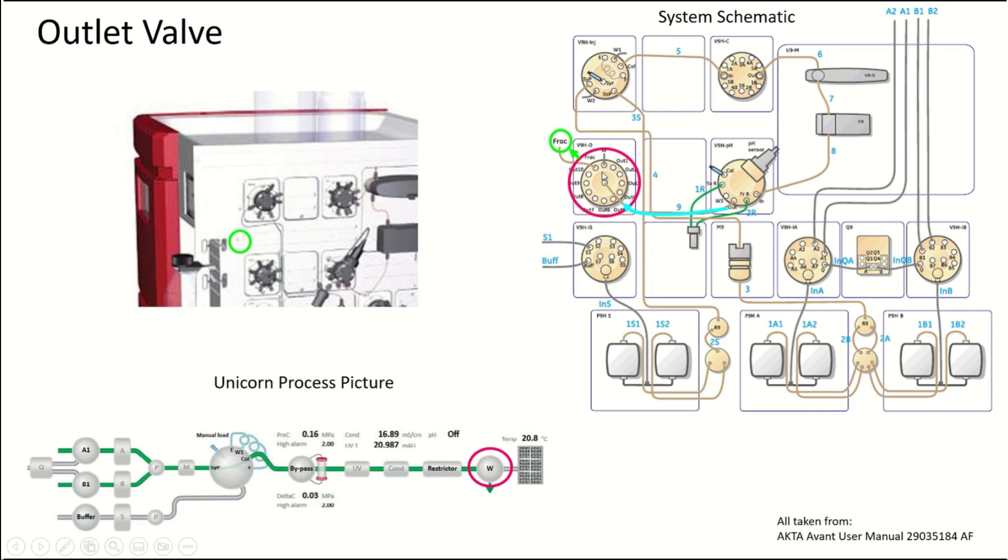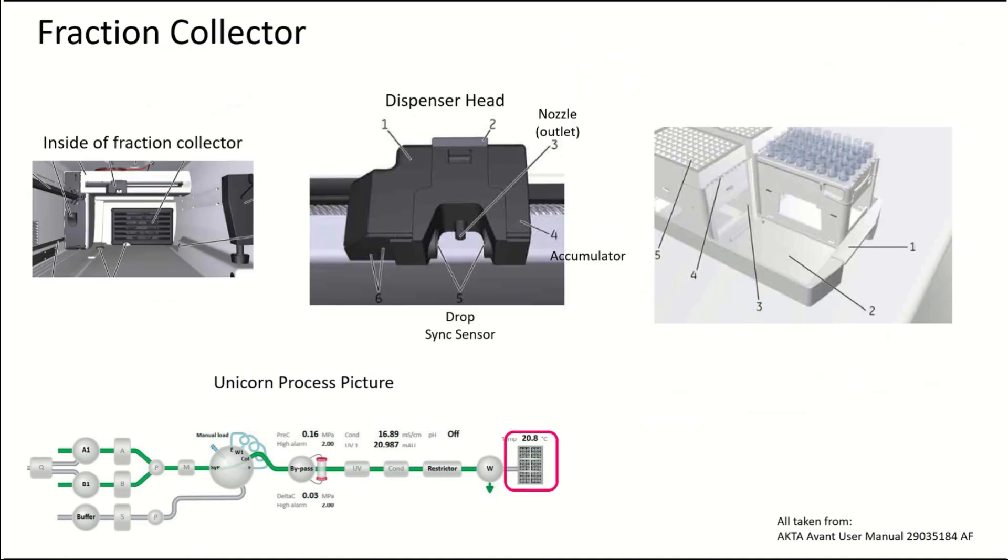The fraction collector inlet is this little tiny hole on the side of the system. It's kind of up and to the left of the outlet valve. A tube goes in there, goes right underneath the LCD screen, and then into the drawer. Looking inside the fraction collector drawer, you have the funnel right here that the dispenser head goes into when it's not collecting a fraction. This is the dispenser head, and it's got an outlet nozzle that drips into each of the different fractions.